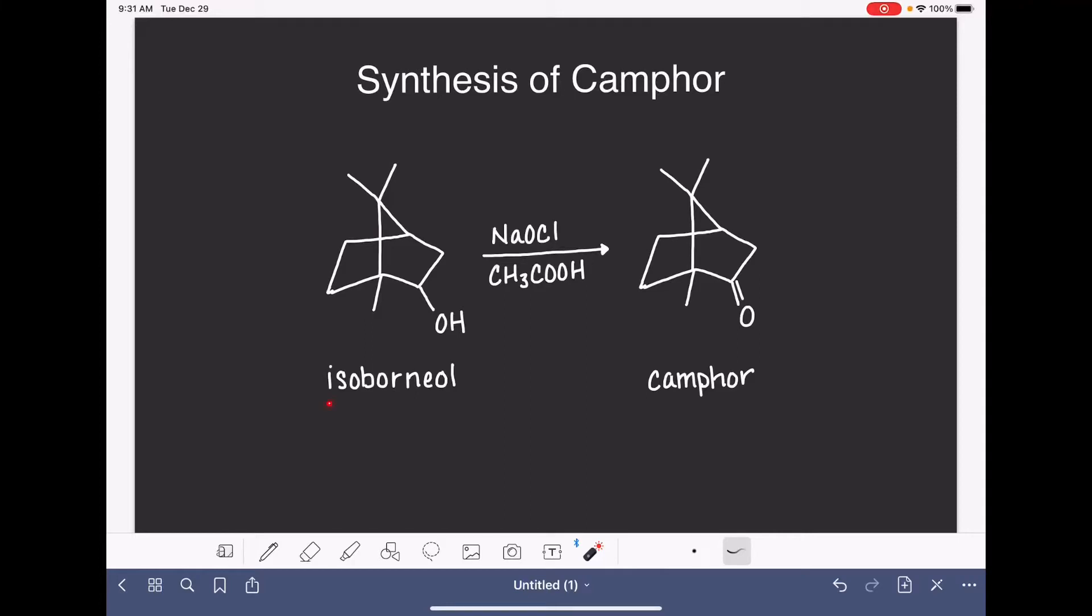In this experiment we're going to be converting isoborneol to camphor. Isoborneol is a secondary alcohol, camphor is a ketone, which means that this process is an oxidation reaction.